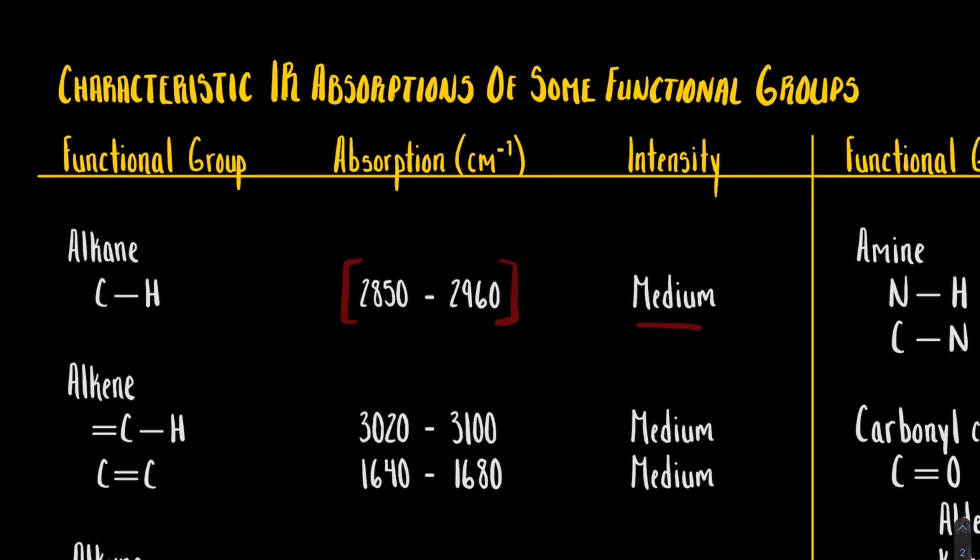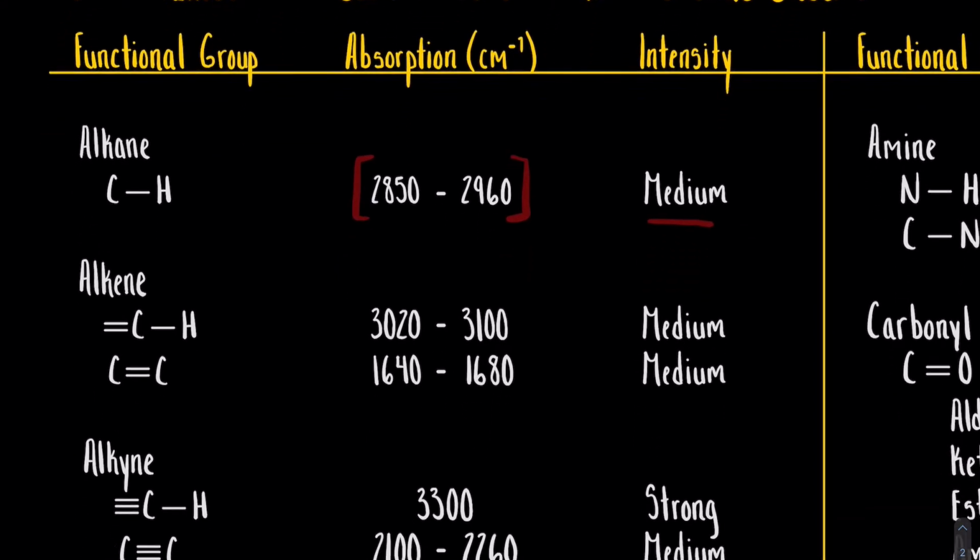It won't be very broad. It won't be very slim. It will just be a perfect looking curve in a way, if that makes sense. It's not going to be too broad. You'll see when we get to the alcohols and carboxylic acids. Those have very broad, strong peaks.